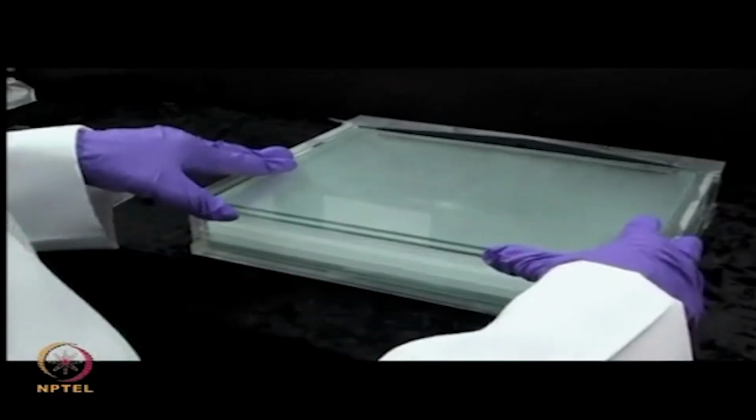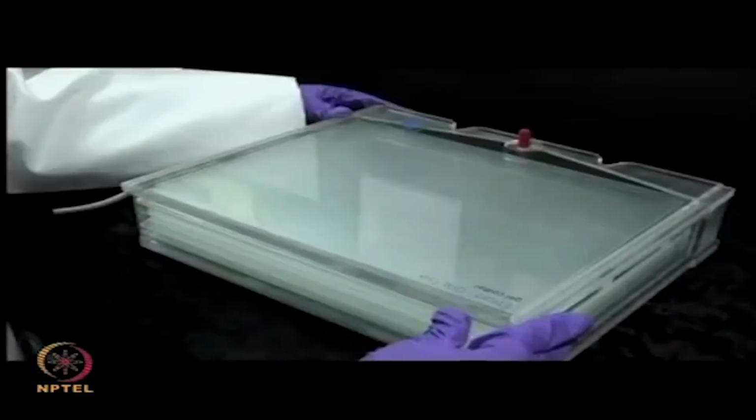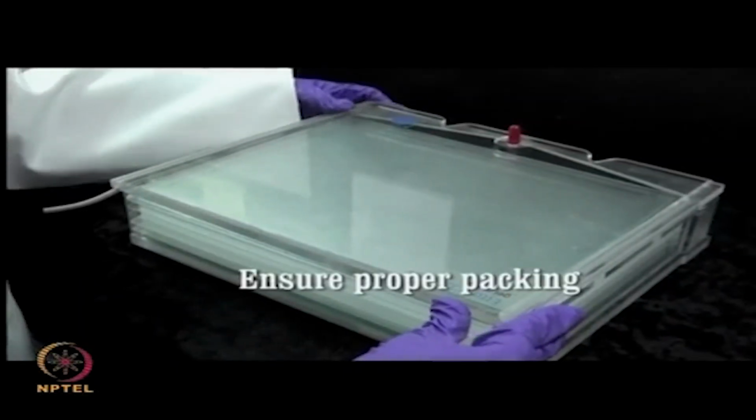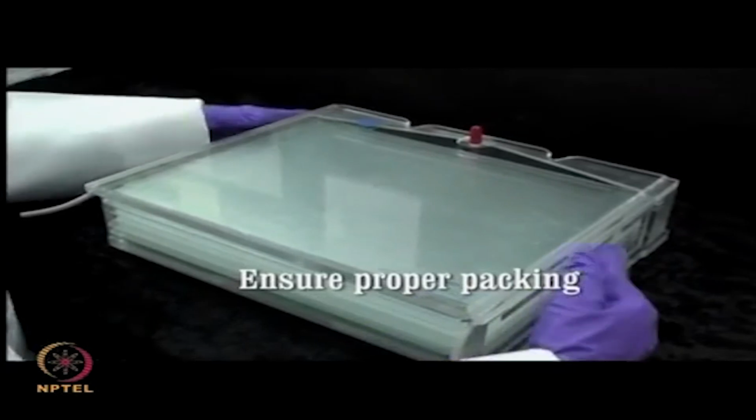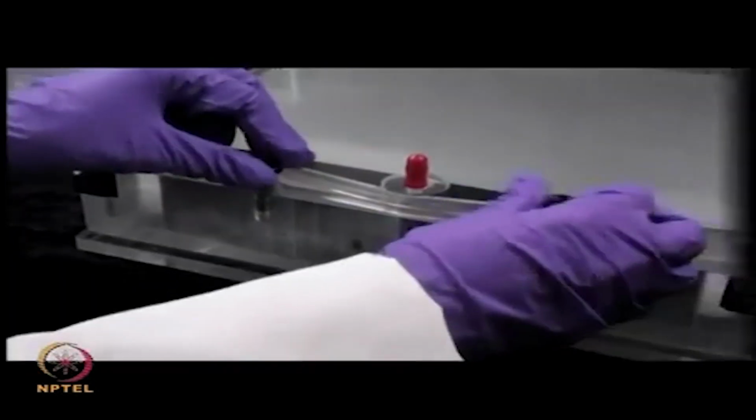Assembly should be tightly packed such that there are no leaks. Close the casting assembly and tighten the screws provided.